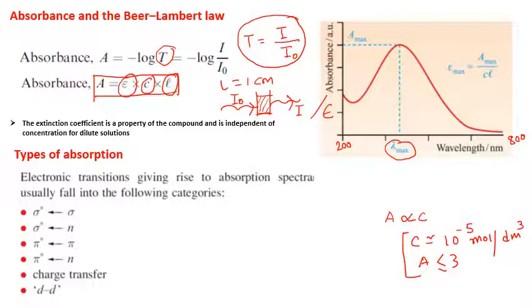Now in the UV spectrophotometer, this whole system is done automatically by the spectrophotometer and the data is output as an absorption spectrum. The whole range of wavelength is detected simultaneously using a diode array detector, and the double beam setup allows the absorption spectrum of the solvent to be subtracted from the sample solution. So the absorption spectra you obtain, shown here in red, have the solvent absorption automatically subtracted.